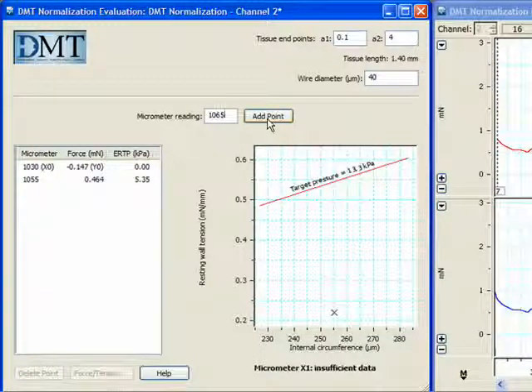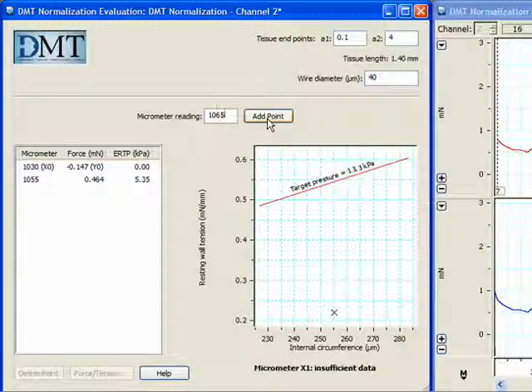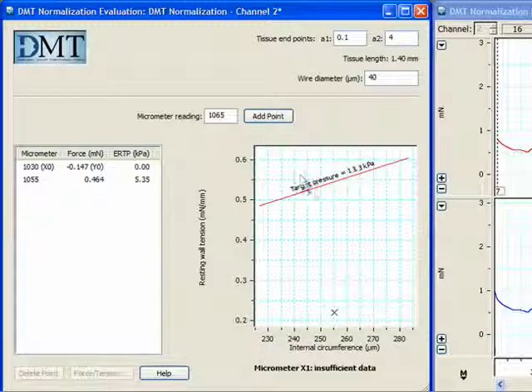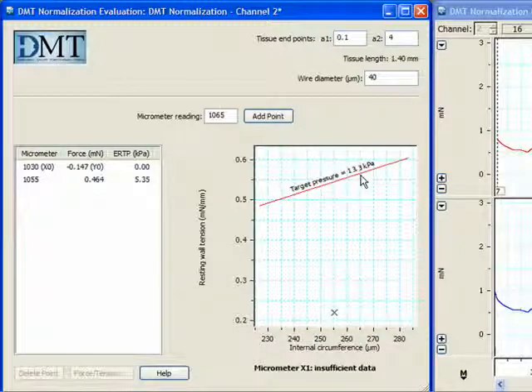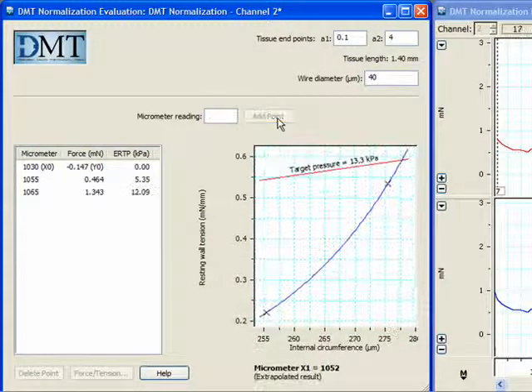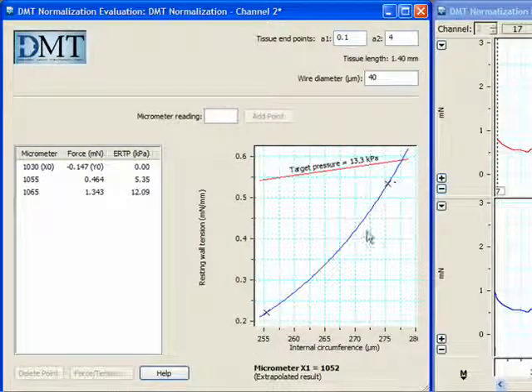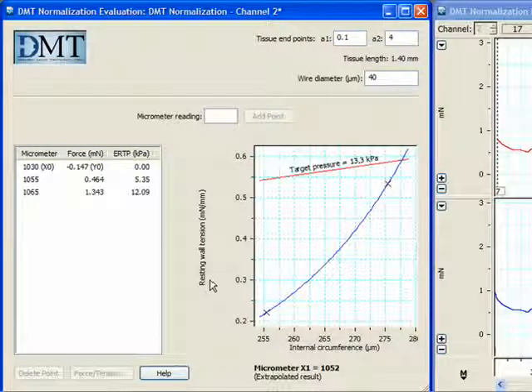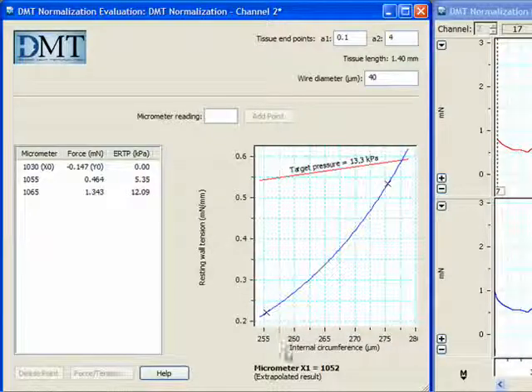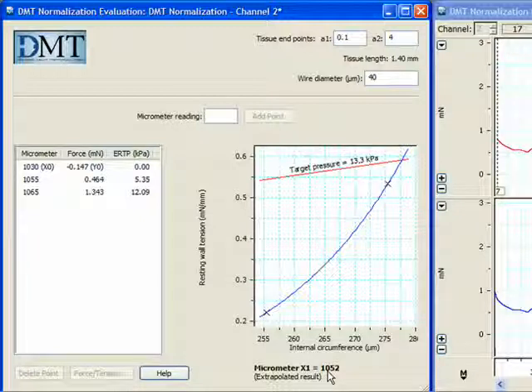After entering three points, the DMT normalization module for channel 2 will be able to extrapolate the micrometer reading at which the target pressure of your vessel will be 13.3 kilopascals. Clicking Add Point, it plots the internal circumference versus the resting wall tension in millinewtons per millimeter, and it tells us the micrometer reading at which we need to set our micrometer for bath 2.